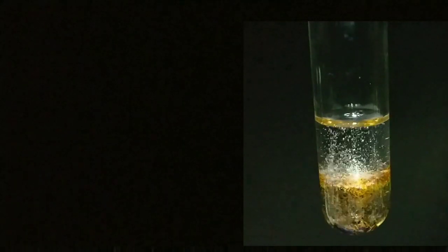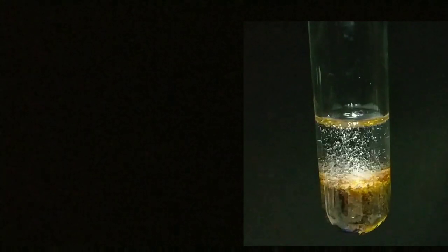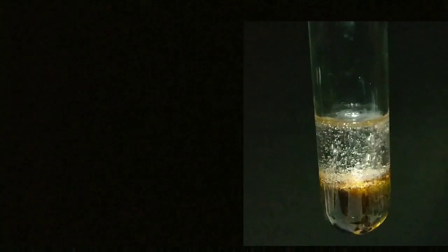I have put off the lights so that the reaction will become much more interesting. You can see the vigorous reaction has already started taking place — there are flashes of light, and in the darkness it seems like lightning, hence the name 'Lightning in a Test Tube.'